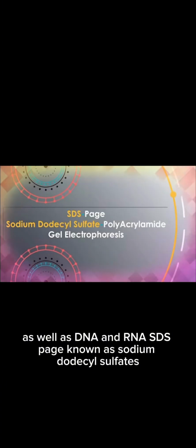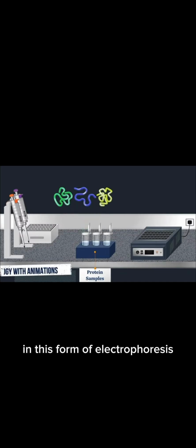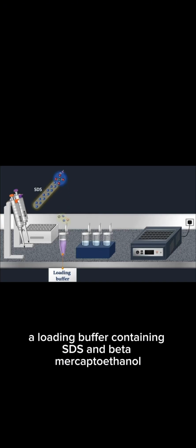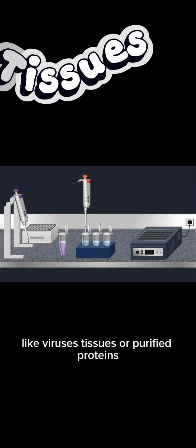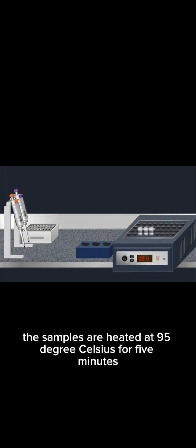SDS-PAGE, known as sodium dodecyl sulfate polyacrylamide gel electrophoresis. In this form of electrophoresis, proteins are separated in terms of their molecular weight in a polyacrylamide solution. For sample preparation, a loading buffer containing SDS and beta-mercaptoethanol and blue dye is added to the protein samples. Protein samples can be biologically derived from various means like viruses, tissues, or purified proteins. When the loading buffer has been added, the samples are heated at 95 degrees Celsius for 5 minutes.